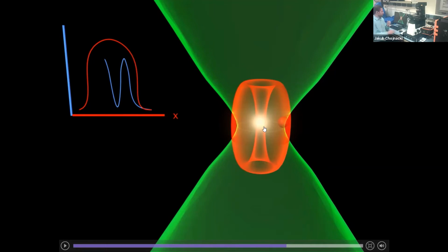So in very simple terms, what we did is we squeezed the fluorescence excitation volume from this quite large 250 nanometer diameter size to something that is much, much smaller. And this microscope is able to give you a 20 to 40 nanometer resolution, which is a very big improvement. We're talking about a 10-fold improvement in the resolution. And 20 nanometers is much, much smaller than a virus size, which becomes important.